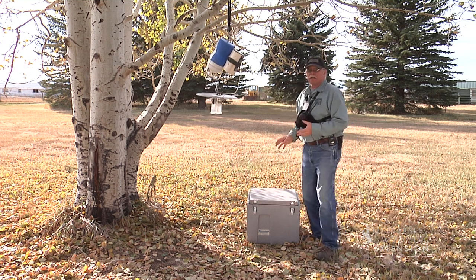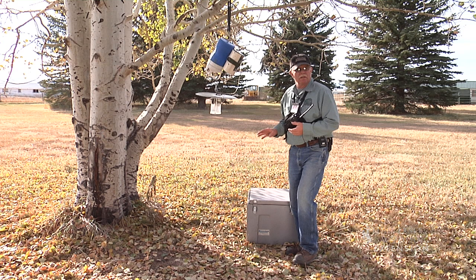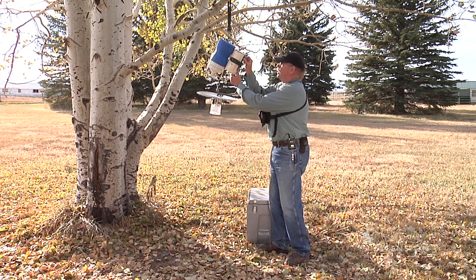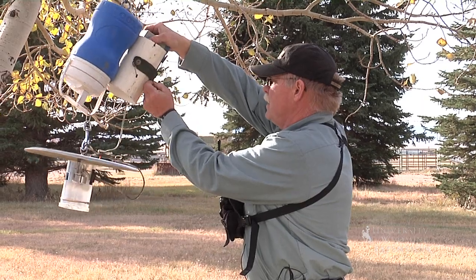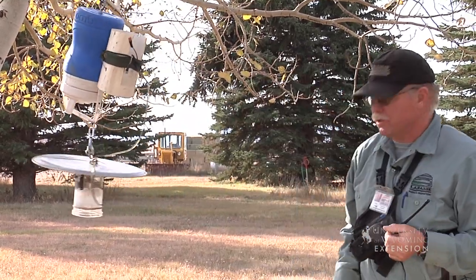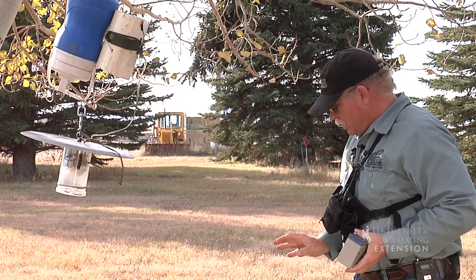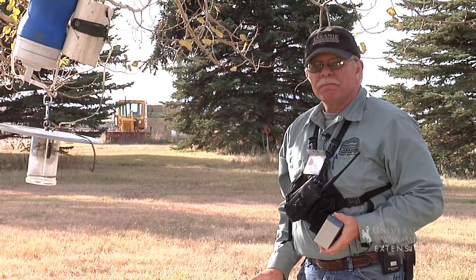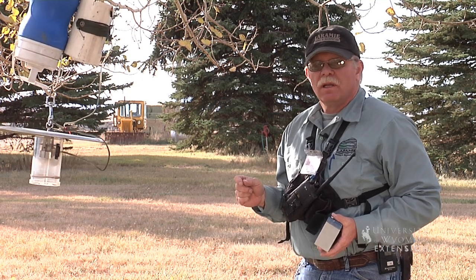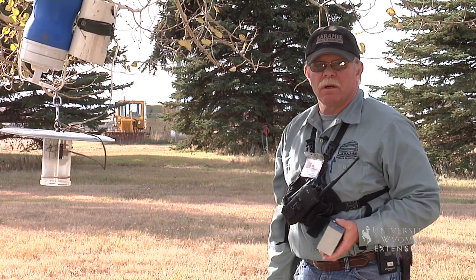The dry ice inside the cooler starts preserving those mosquitoes so they stay in good condition to work with. We'll unplug the battery, take it back in, and recharge it for tonight's operations. We'll go to 12 different sites today, pick up the mosquitoes from those different collection points, and head back to the lab to do our analysis.